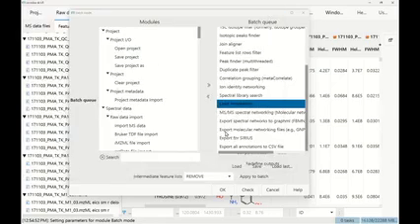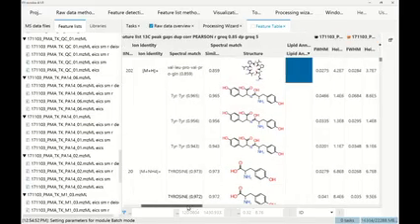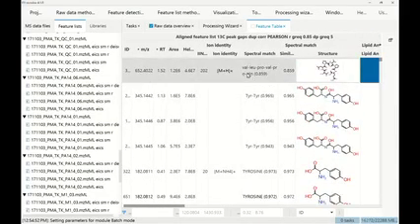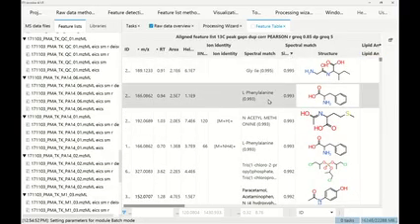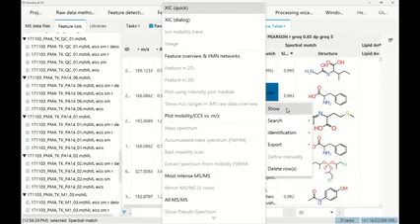Yeah. And you can also see we did molecular networking in here, and this is one thing that we can now go into. So in the table, I can, for example, sort by similarity score, maybe phenylalanine, and then right-click on any row in the table. We can right-click and then open the feature overview, ion identity molecular networking networks.